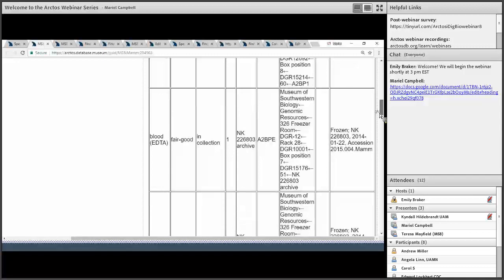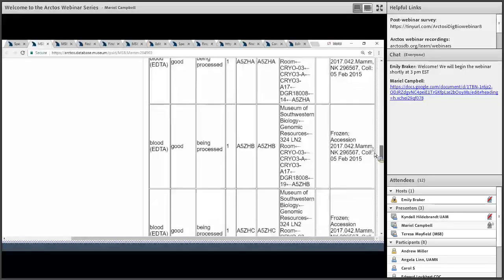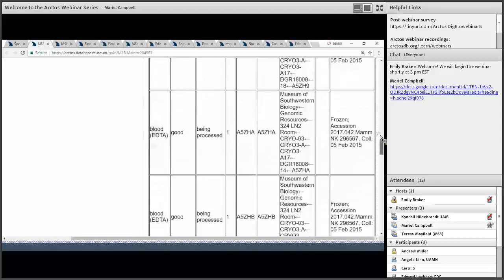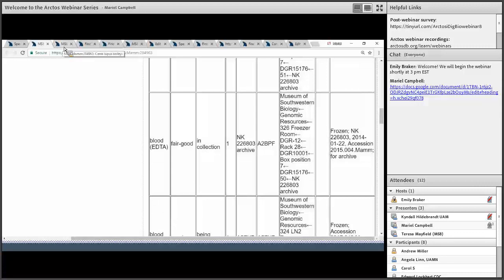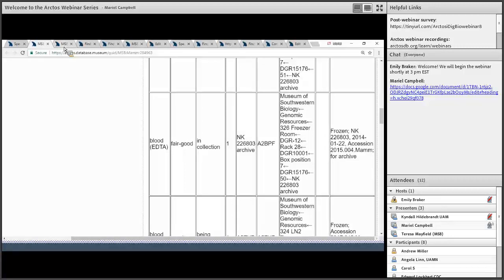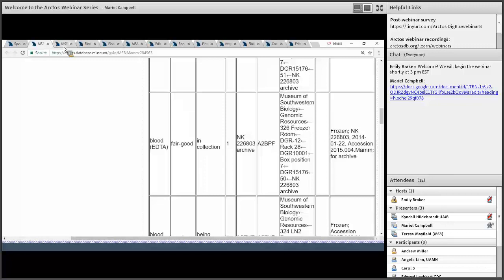This particular wolf has a lot of parts — many different blood samples taken over multiple collecting events. The point is that object tracking in Arctos tracks individual parts and also the containers of those parts. Different types of parts may include frozen tissues, fluid preserved material, skin and skeletal material, microscope slides, and photographs, and these things may be stored in different locations. The catalogued number and the barcode number are not the same because barcodes track the physical parts, whereas the catalogued number tracks the specimen record or data.